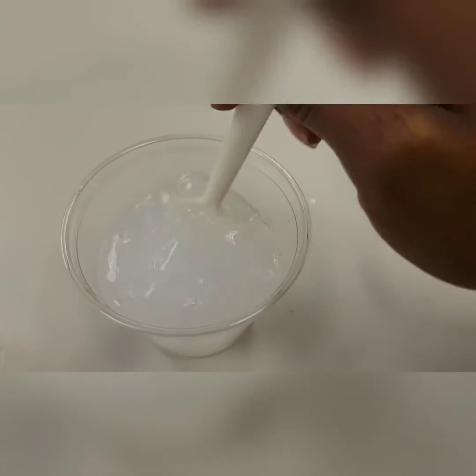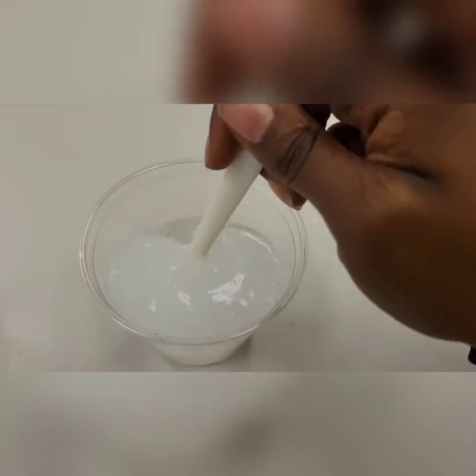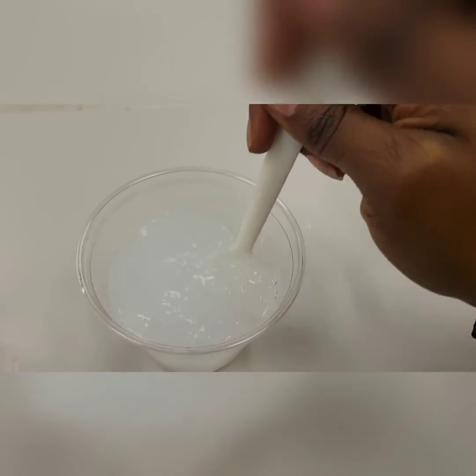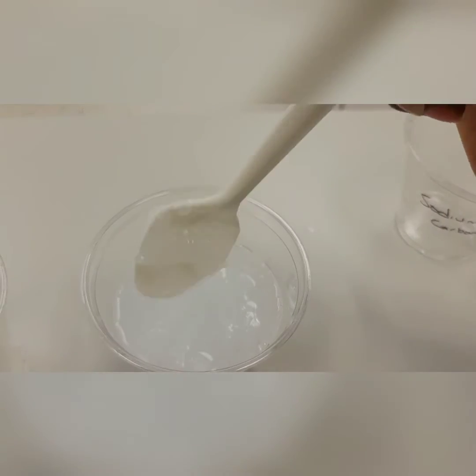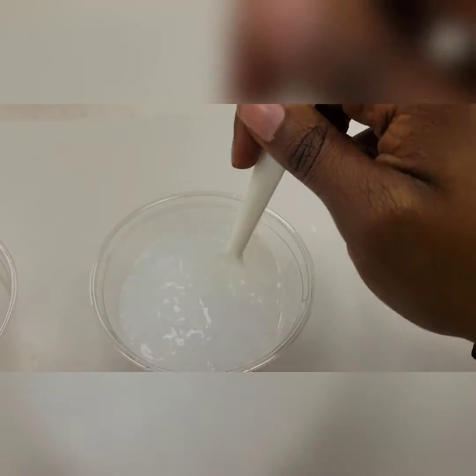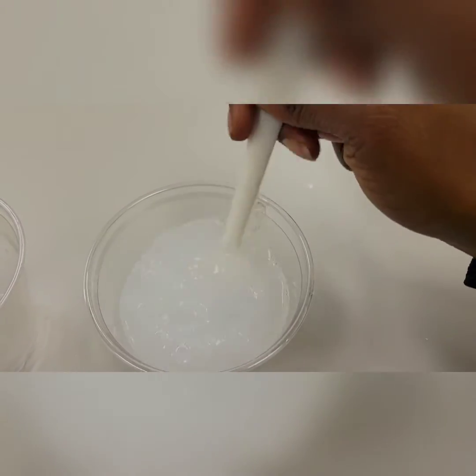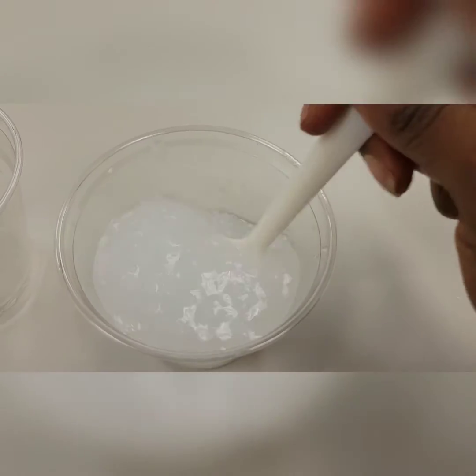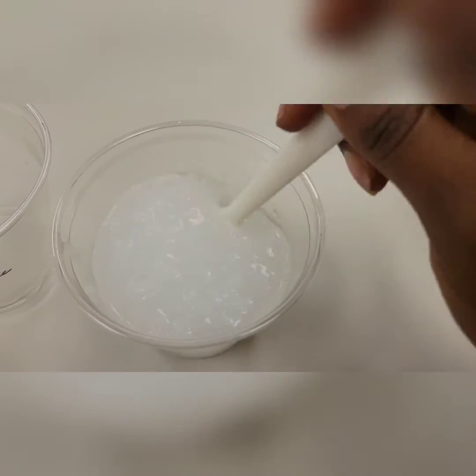So again, the consistency of my liquids has changed as I stir. It is becoming thicker and thicker. It is also becoming more opaque. So that liquid is a lot more viscous than it was before, not the smooth flowing liquid that I initially had with the two substances.